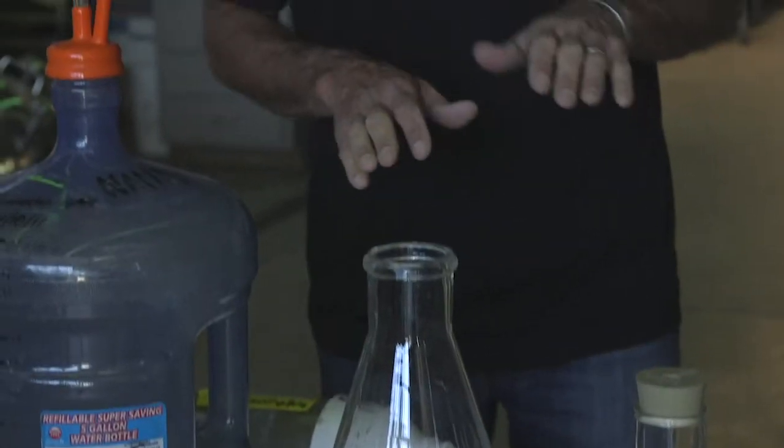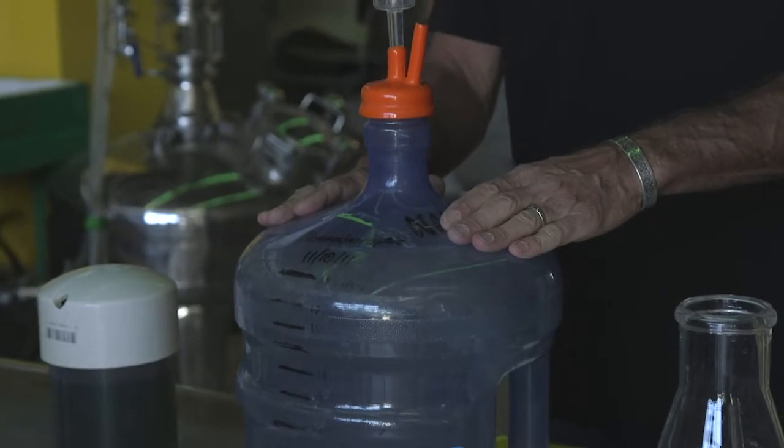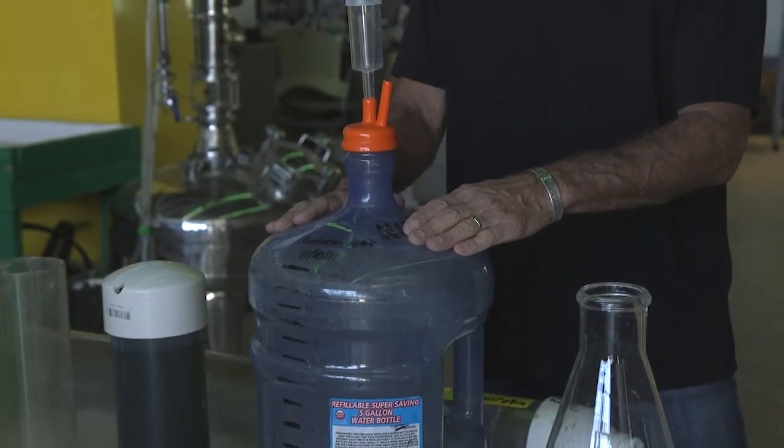Many algae operations in their laboratory scale up from this phase using what's called a carboy, which is quite effective. They're up to about 20 liters. They use artificial light and keep it in their laboratory as they start to scale up that culture, because you need enough seed stock to get into commercial production.